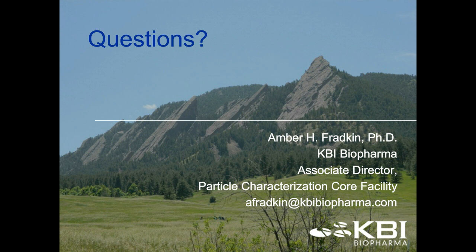Thank you, Amber. Next question, someone says, does one encounter different density particulates, and do different techniques account for that variability in density? Absolutely.